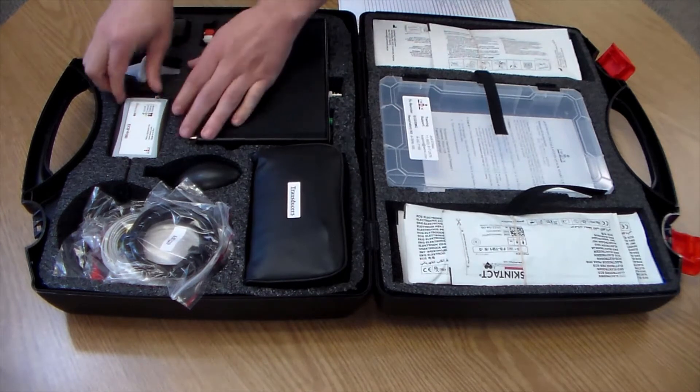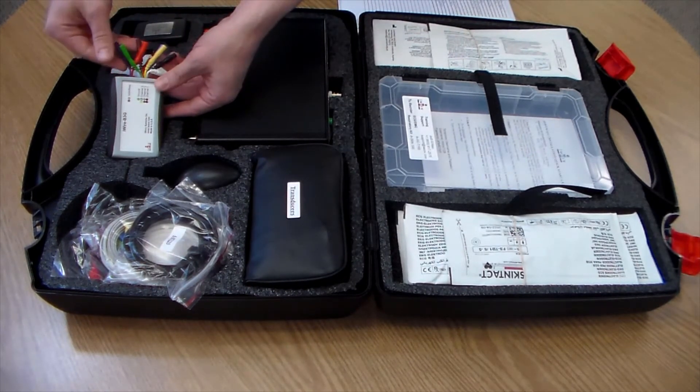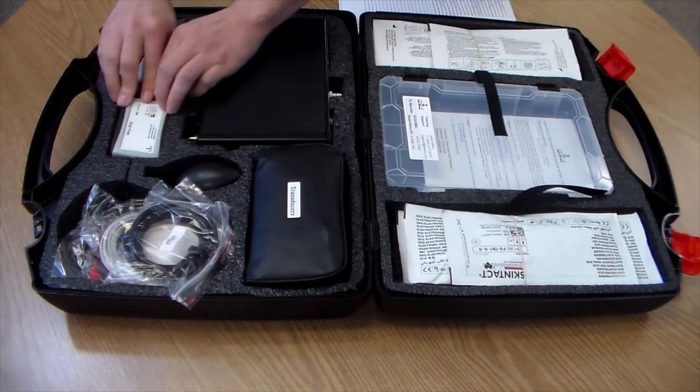The iWire B3G biopotential amplifier is used for experiments involving ECG, EMG, GSR, and respiration.